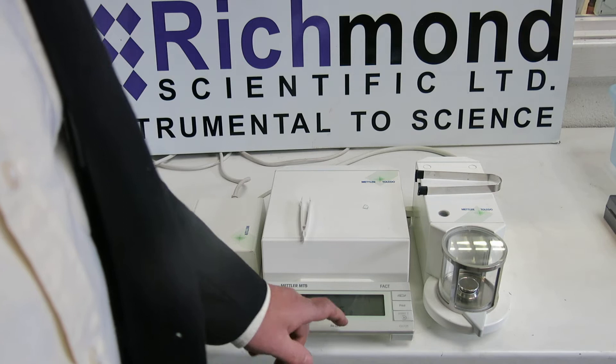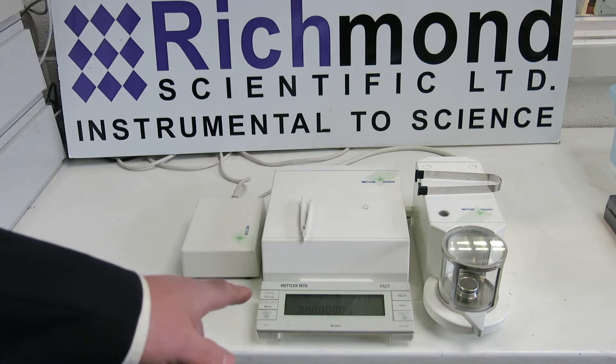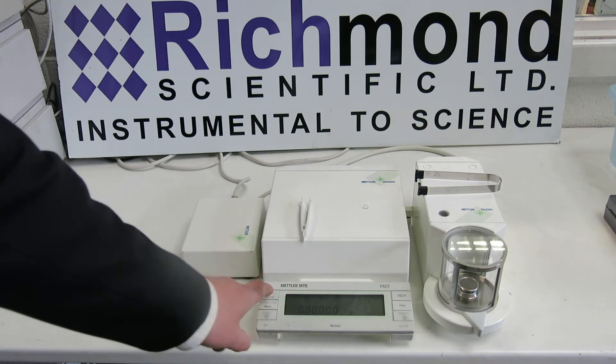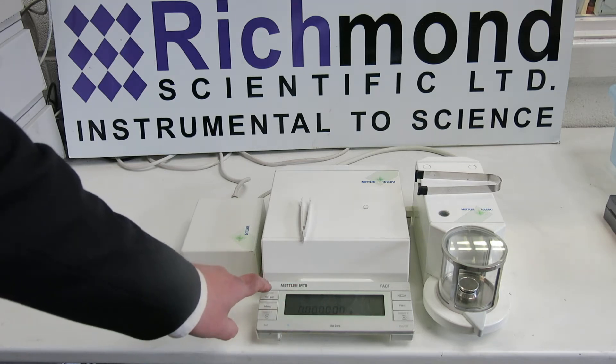We'll now zero the unit. You can see it's zero zero zero. You can see that you can alter the display — there's an extra decimal place.